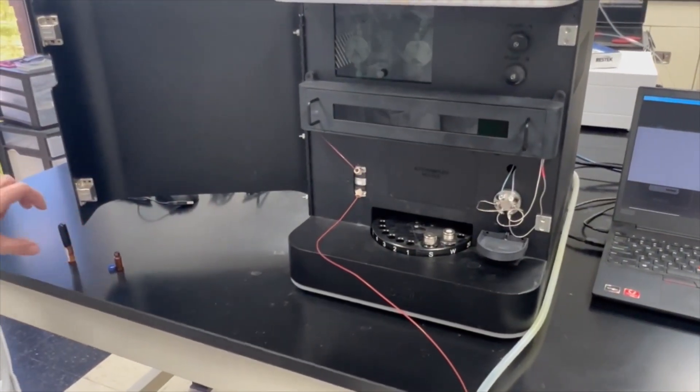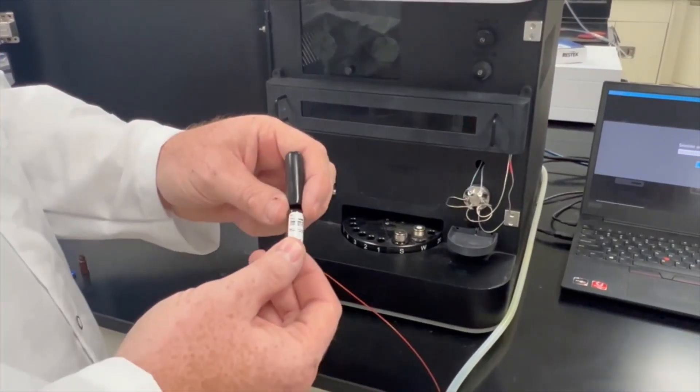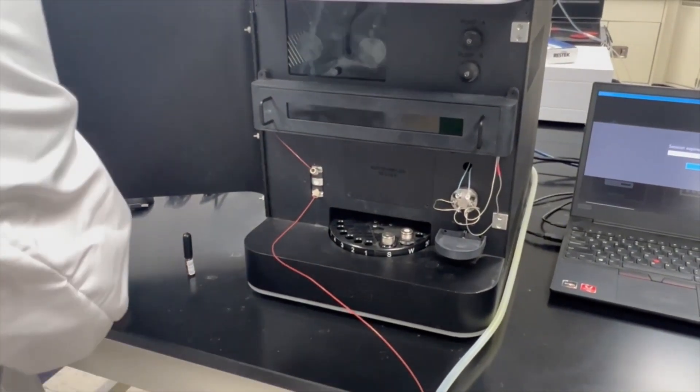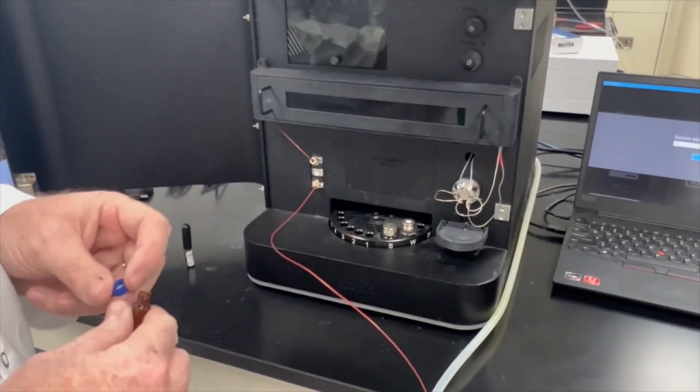And then we're going to take our sample. We're going to crack open our HPLC gradient system test mix and put it in one of our vials. And we're going to put it in vial number one.